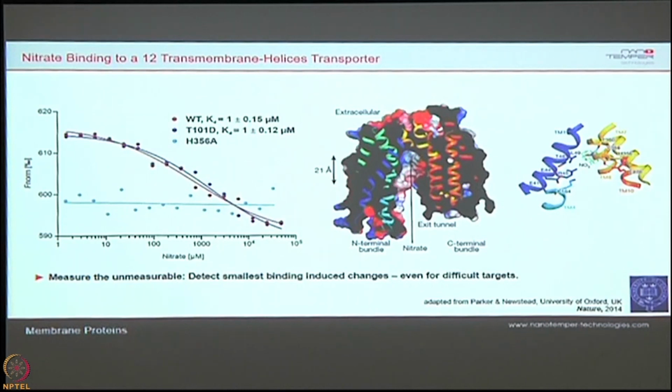So here in this technique, as I said, we are using only 3 to 4 microliters of the sample, so that thing can be nullified. So even membrane proteins can successfully be studied here. As you can see, the paper again hit Nature, where the membrane-bound protein has been expressed with GFP, and that particular protein has been studied for microscale thermophoresis.